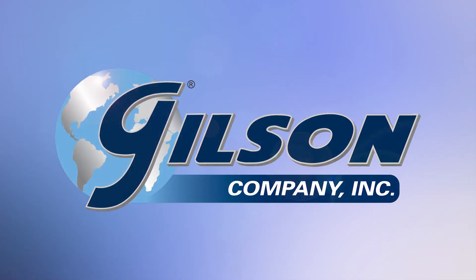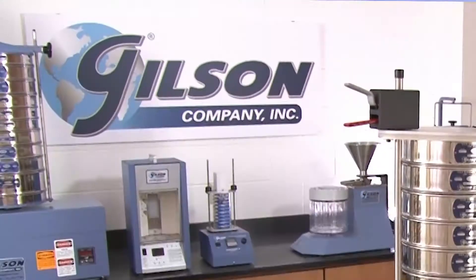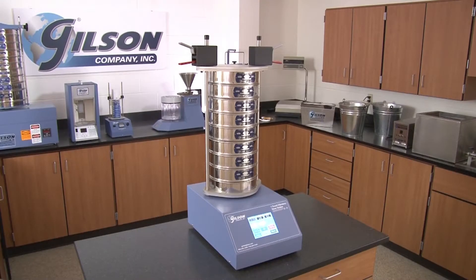When you need quiet, precise, and repeatable separations of materials from number 10 to number 635, then Gilson is your best choice.